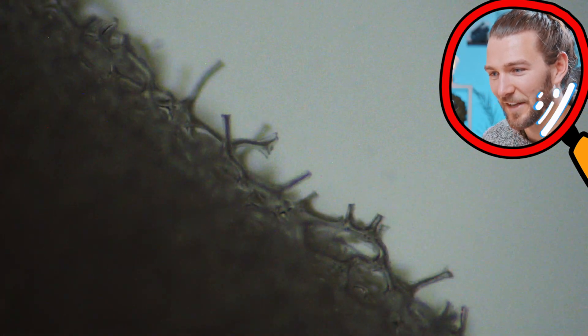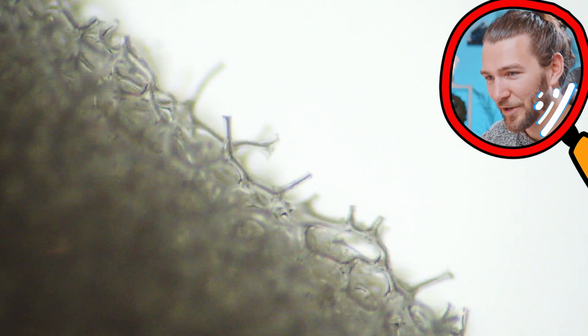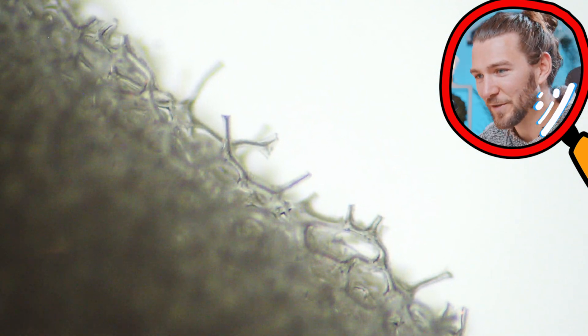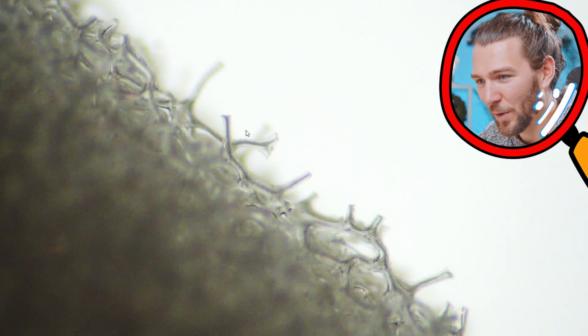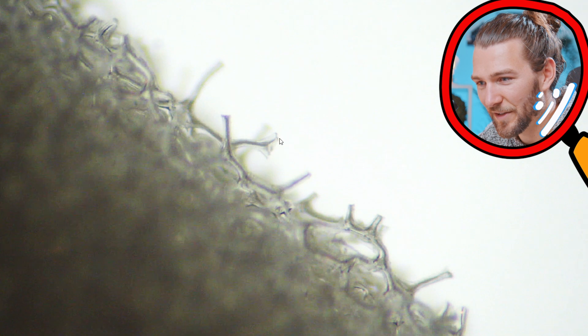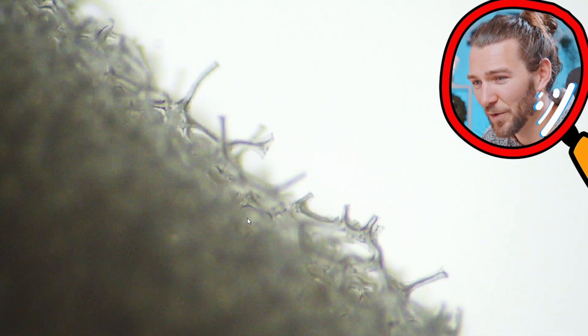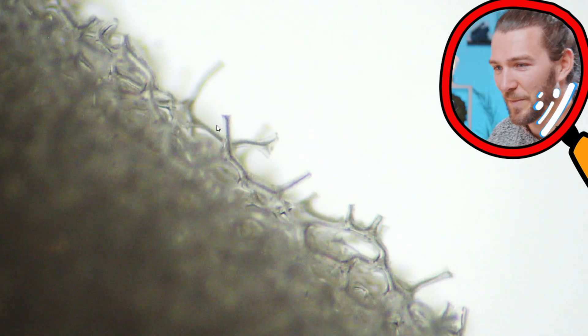How edgy it looks like. Crazy, it's super thick and looks really sturdy here. And you can see also the edges are cut off quite sharply in here. Even, yeah, you see there's material in here. This is the whole tip, this whole thing. So this one in the production isn't so clean, let's say.